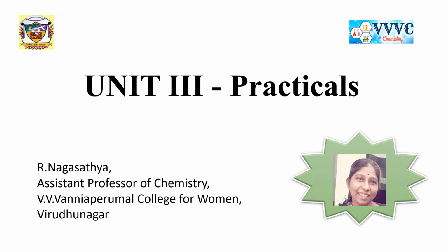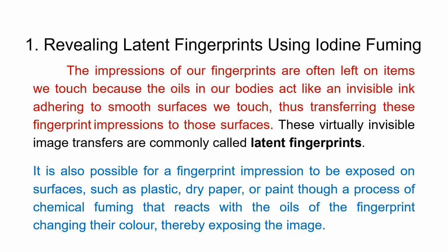Yes, good morning students. In this video, let us see about the practicals that we are studying under forensic science. The first practical is revealing latent fingerprints using iodine fuming.